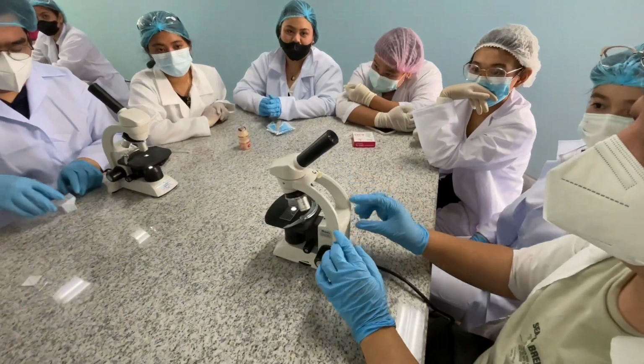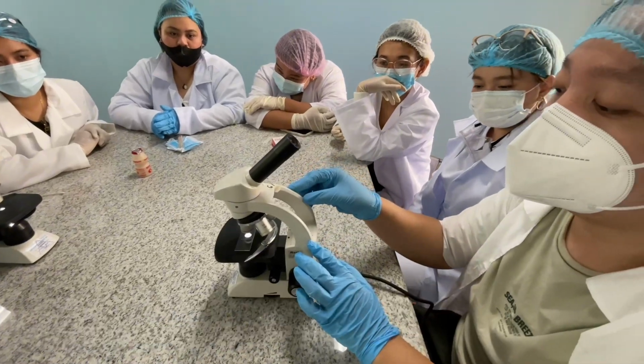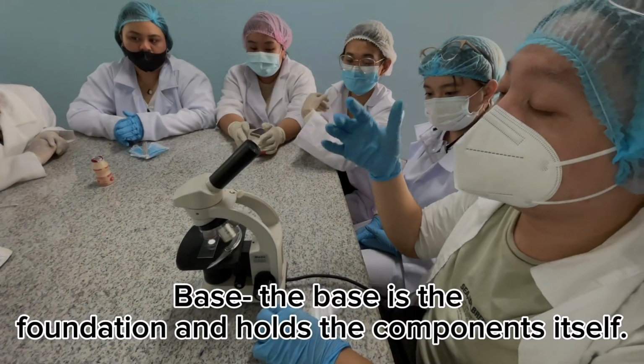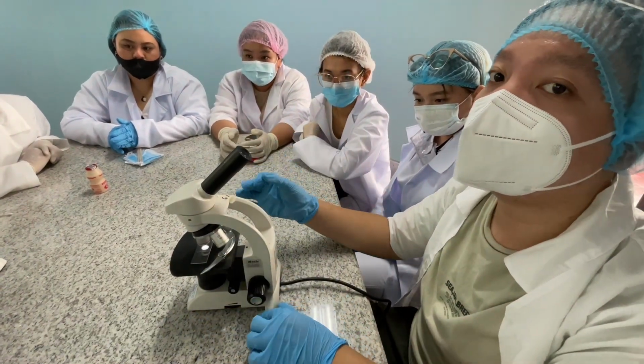First is our body, which connects all the components of the microscope. This is very important, as well as the base. The base is the foundation and holds all the components itself so that nothing gets lost and it has stability.